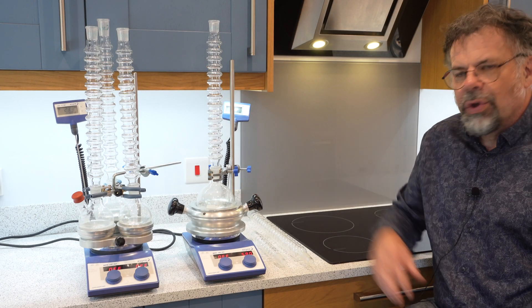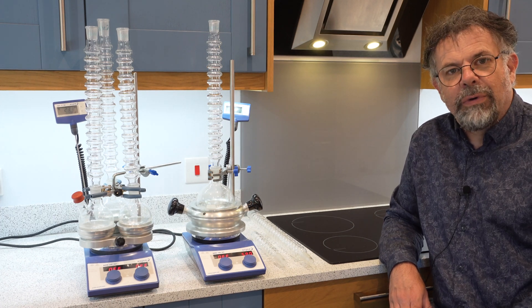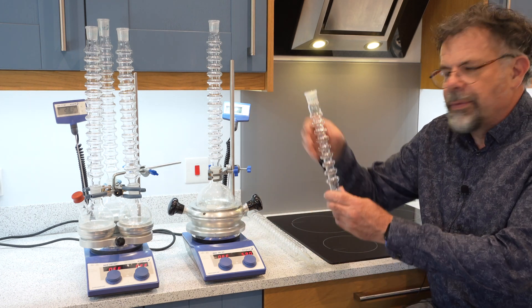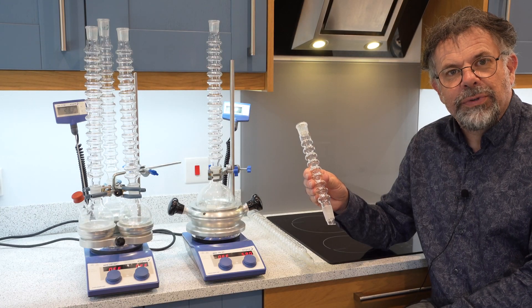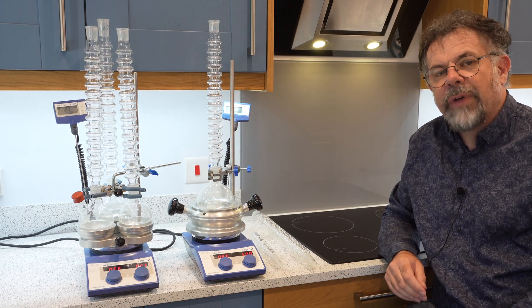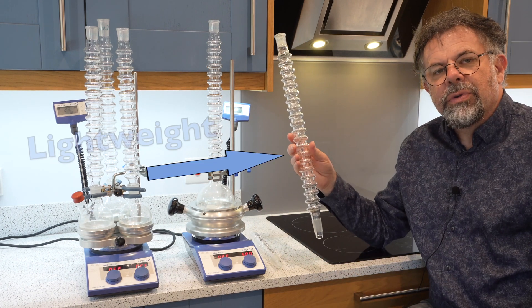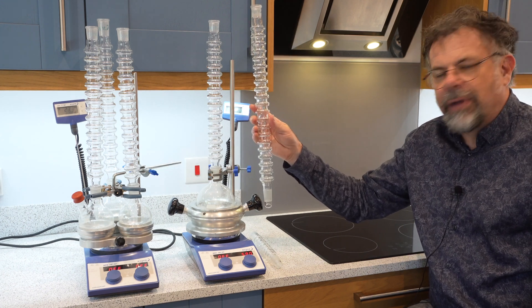Condensin can work with any round bottom flask from as small as you wish up to a one litre volume. We have three different sizes: a 200 millimetre effective length suitable for round bottom flasks up to 100 millilitres; a 350 millimetre effective length version suitable for up to 500 millilitres; and a 450 millimetre effective length for volumes up to one litre.